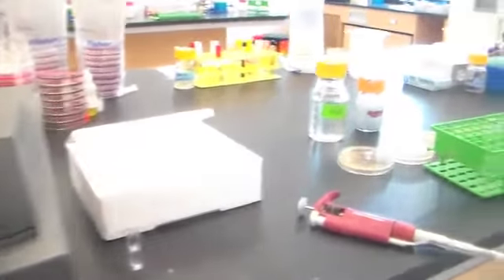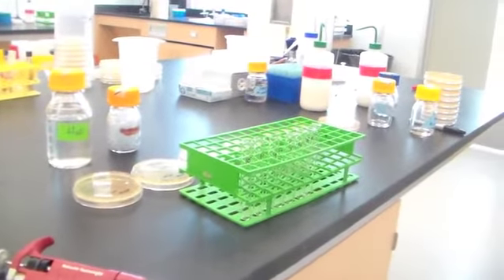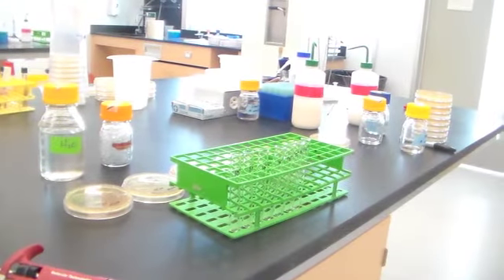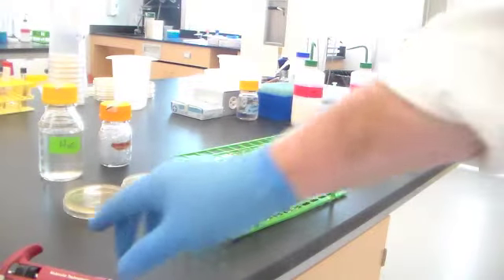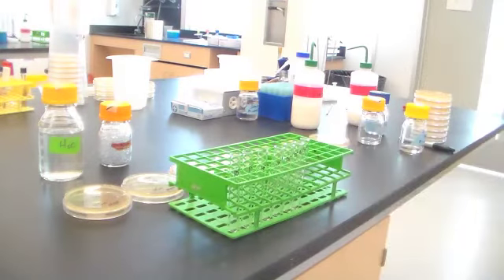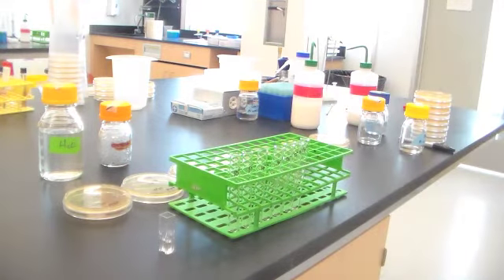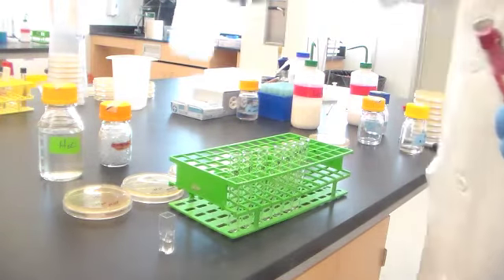In this particular case, since the culture was just inoculated, we can pretty much assume that all of the bacteria in there are alive. But now we're going to do a viable count. The first thing that you're going to do is I'm going to take out the cuvette containing the 500 microliters of culture that I just used in the spectrophotometer.